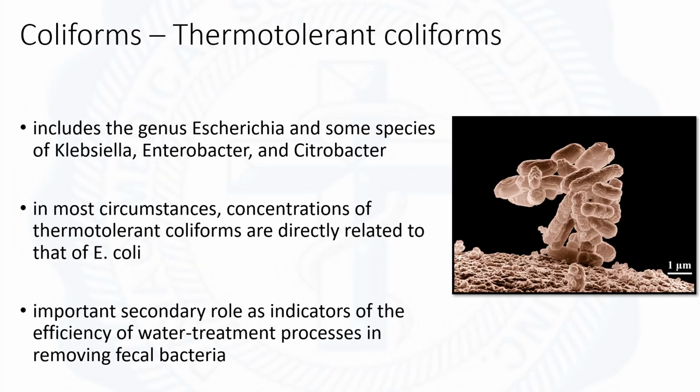Thermotolerant coliform bacteria are those organisms that are able to ferment lactose at 44 to 45 degrees Celsius. So the group includes the genus Escherichia and some species of Klebsiella, Enterobacter, and Citrobacter. Thermotolerant coliforms other than E. coli may also originate from organically enriched water such as industrial effluents or from decaying plant materials and soil.